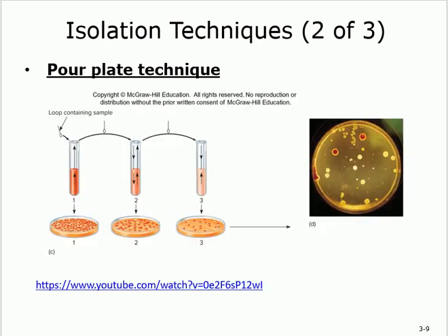The second type is called the pour plate technique. And from the name, you're just pouring the organisms. You pour it in different spots and it's going to distribute. There is a YouTube video here that's describing this. This is the pour technique. Just look at it.